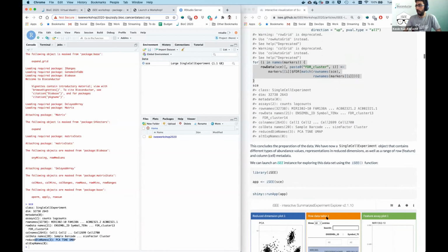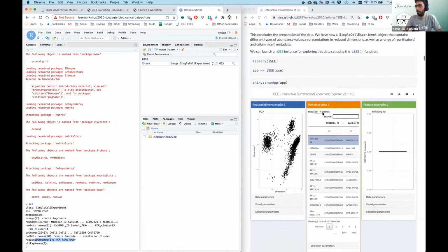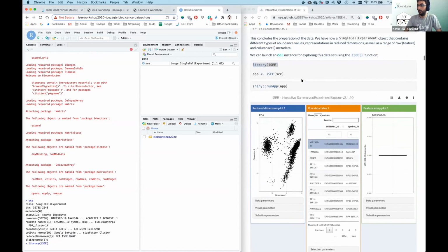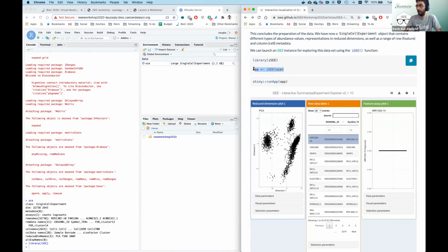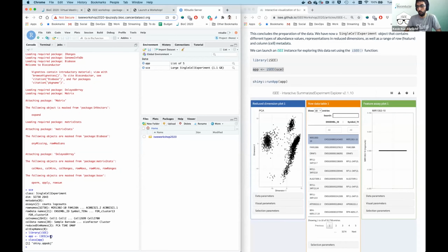Right, so getting to this, that's usually what you would do in your analysis. And iSEE just sits at the bottom of this workflow. At its simplest, we really try to make it easy for a newcomer. So you can load the iSEE package and create a fully functional Shiny app by just saying iSEE of your object. And if you store that in the app object, we have a Shiny app object.